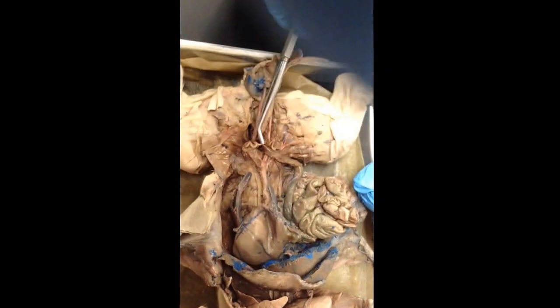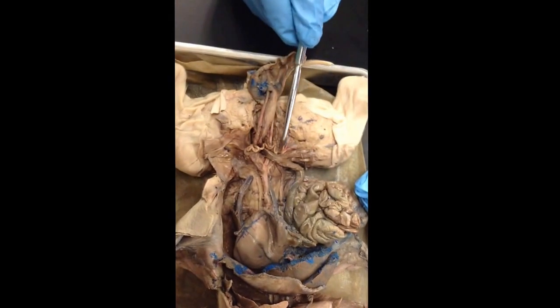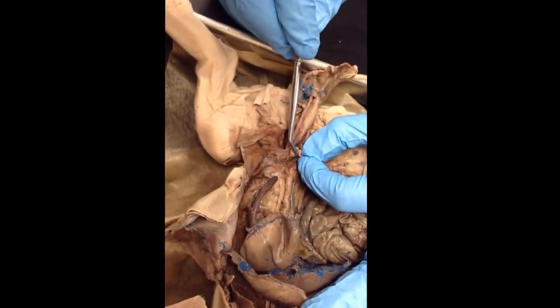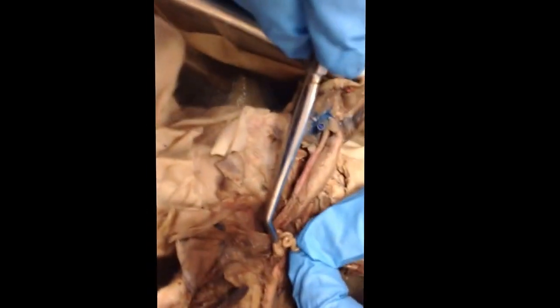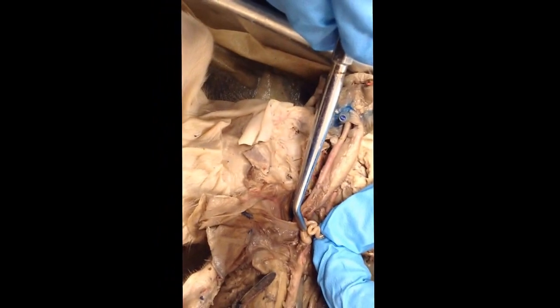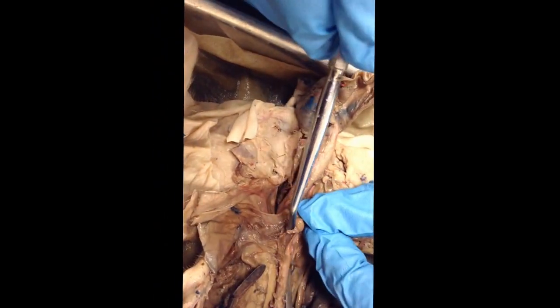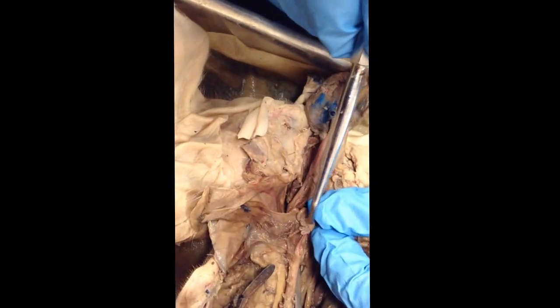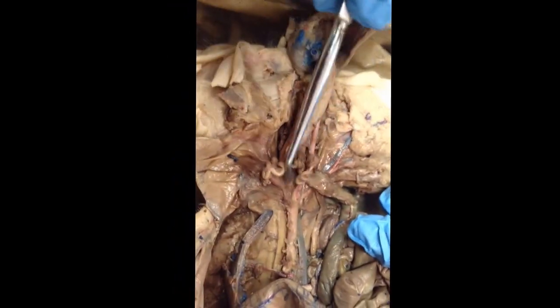And then these are the uterine horns, the little swirly things. And then you have these little ball things. That's the ovary, this little tiny thing. And then these little small crumpled up tubes, those are the fallopian tubes. They're really tiny. So fallopian tubes over the uterine horn. And then it's the same on the other side.